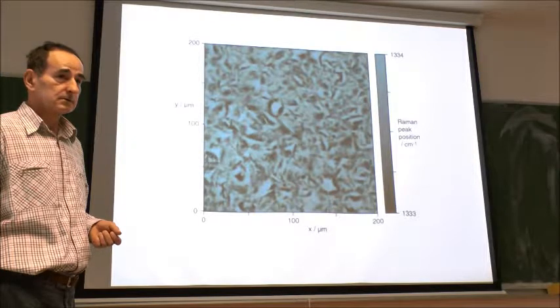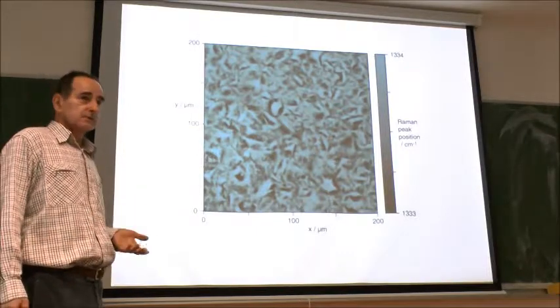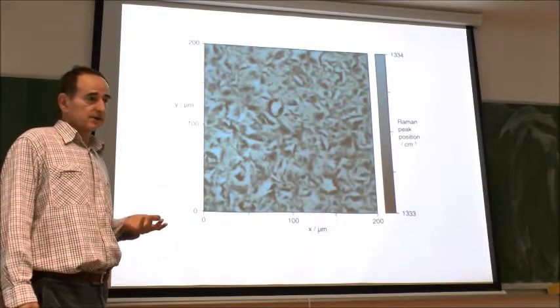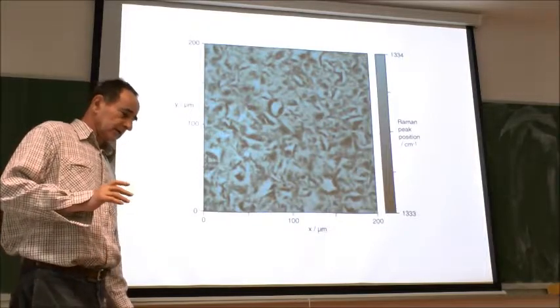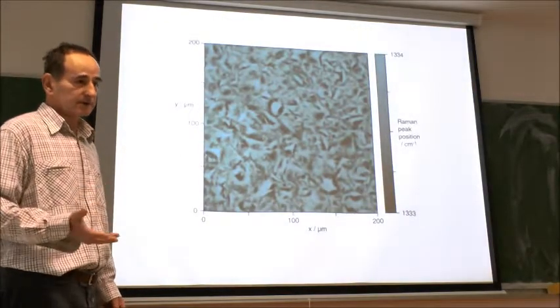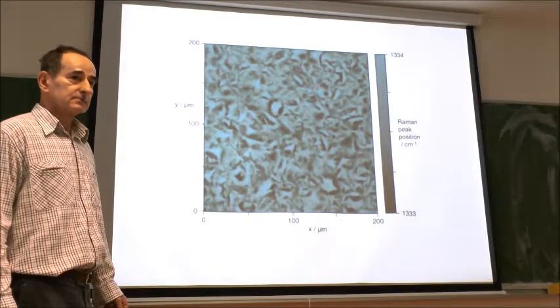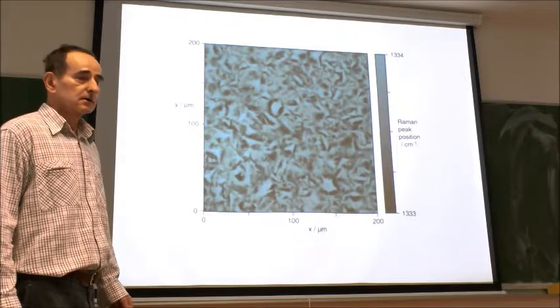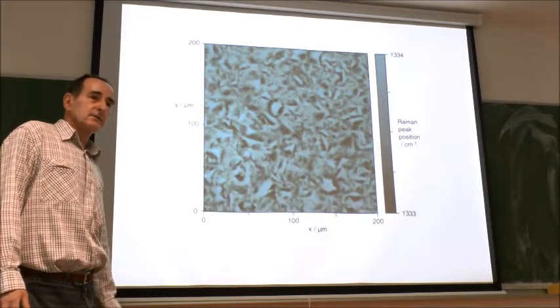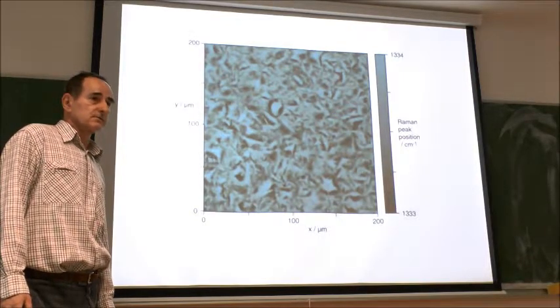I wonder how you can analyze anisotropic material. Do you have some polarizers for the laser or the scattered light? Yeah, I didn't mention that there is of course a polarizer, an analyzer, and all is automatic. Also, you can turn the polarizing light by a fraction, I think 5 degrees or something like that, in steps. So for somebody who is studying symmetry of crystals or orientation, that would be pretty good instrument to work on.